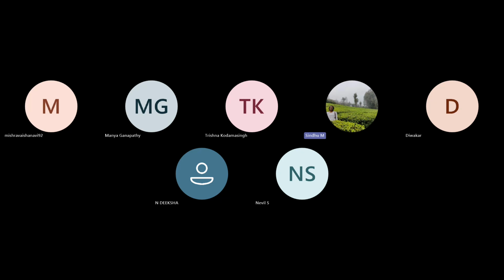So right now it is a merged channel image. So it has calculated the mean intensity for red, green, blue, all 3 channels together. And then X and Y are the centroid coordinates. And then you also have the perimeter. And this major and minor axis, it fits the outline that we draw to an ellipse and gives the length of the major and minor axis and so on.